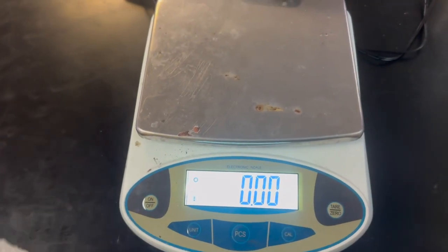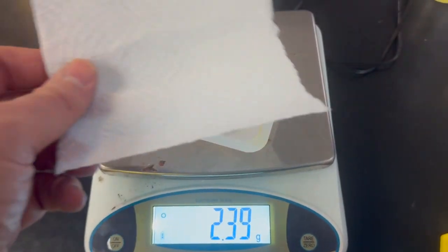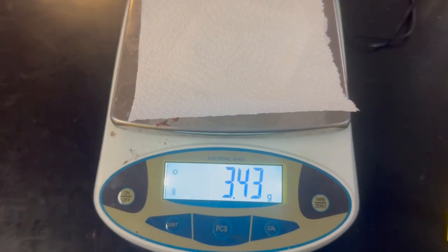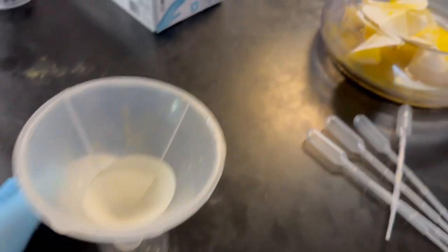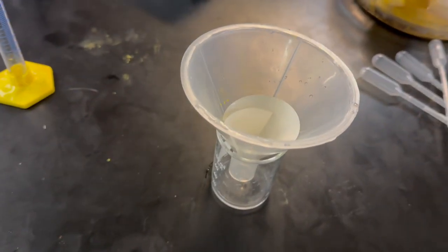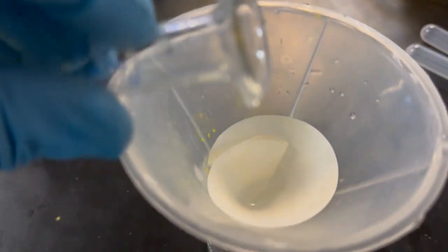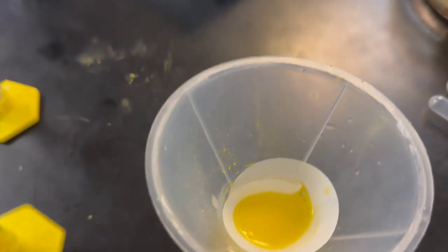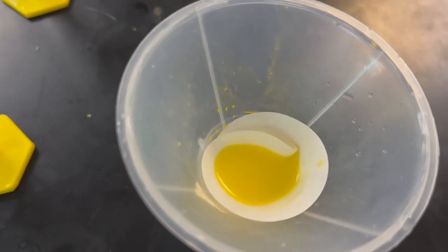Okay. Now what I'm doing here is I'm measuring my filter and my weigh boat. So this gives me my initial weight, and I've already put together my chemicals, so I'm going to pour those onto my filter and let the filter dry for a while to try and get as much off. Now, a side note for this lab is the filter did not dry anywhere near enough. We'd probably have to let it sit for a few days to get a good number.